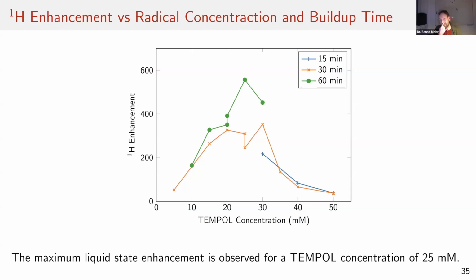Yeah, historically it took quite a lot of time. For example, the work that Pooja did: we knew that we needed something to facilitate spin diffusion, and we first added acetate, and that didn't really work very well.